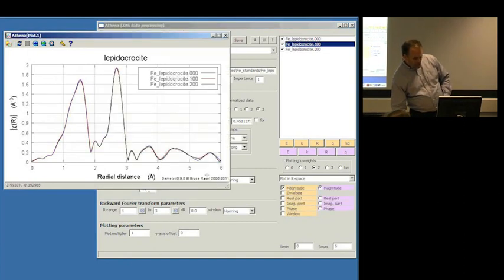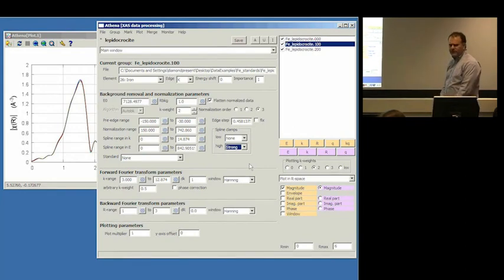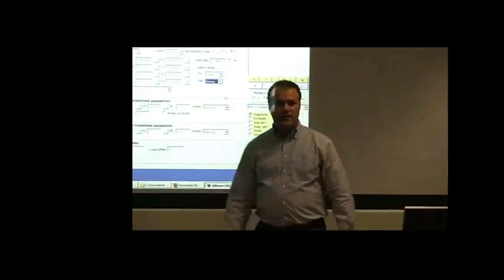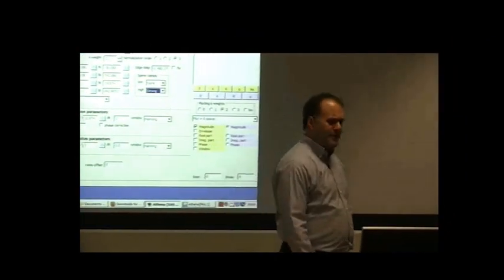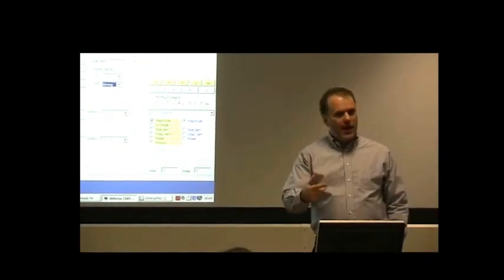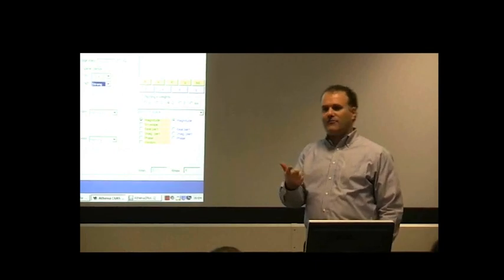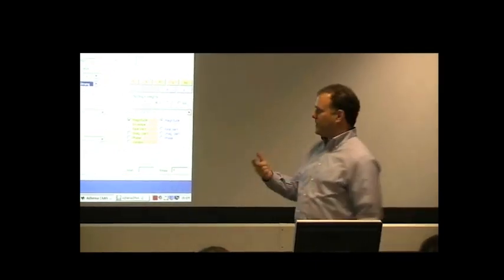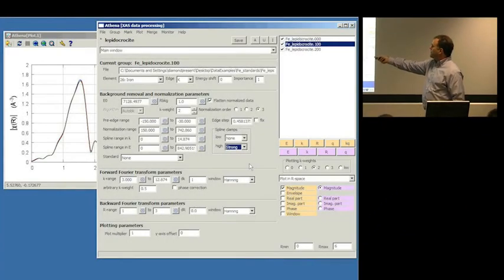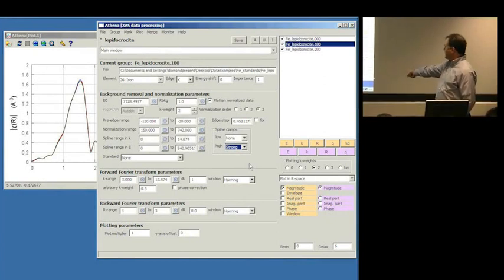So at this point, it's finally time to address your question of how is E naught chosen and why does it matter? I'm going to answer why does it matter first. E naught serves at least two purposes in the software, possibly more, but two that I can think of right off the top of my head. One is it's the reference for all these other numbers. So these four numbers right here, as well as things like the plotting range in energy, are all evaluated relative to the current value of E0.